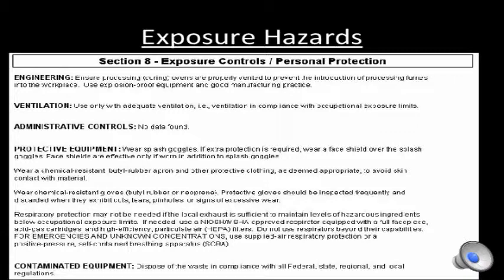If you are ever unsure about specific PPE selection, be sure to contact your environmental health and safety manager for more guidance. Do not proceed with your job task if you do not know what PPE is required to perform the task.